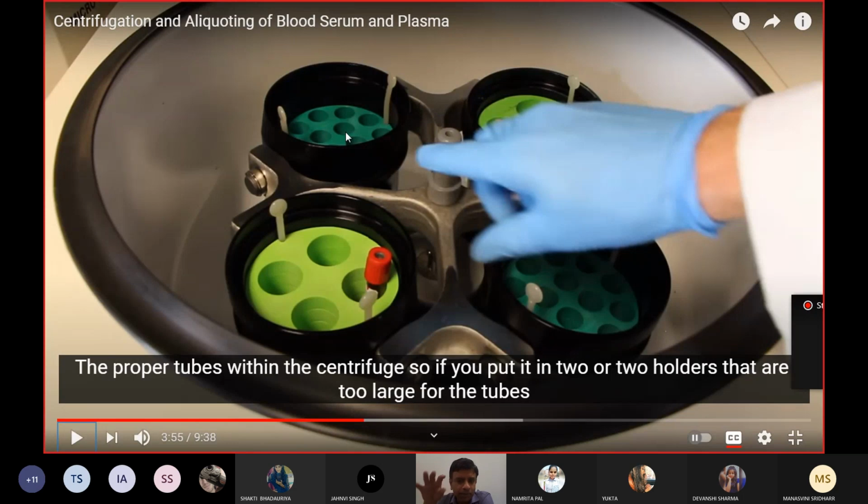Okay. Now there can be sometimes an issue if the solution you are using, for example, if blood has high density, right? So it may have a bit more weight than the water sample. So in that case, you can put a few more drops of water to balance it out.